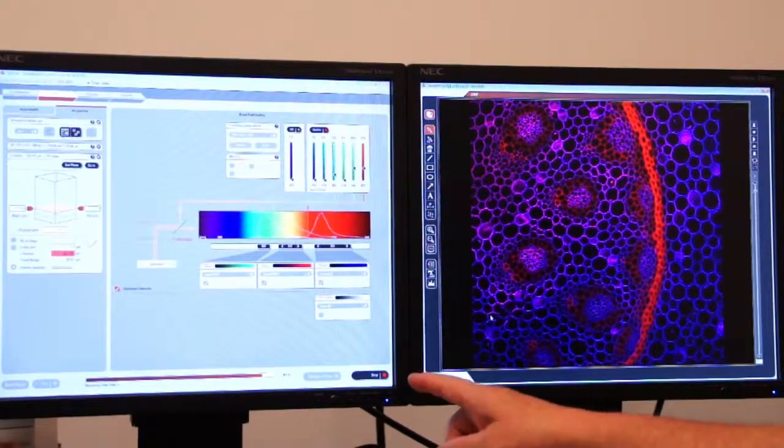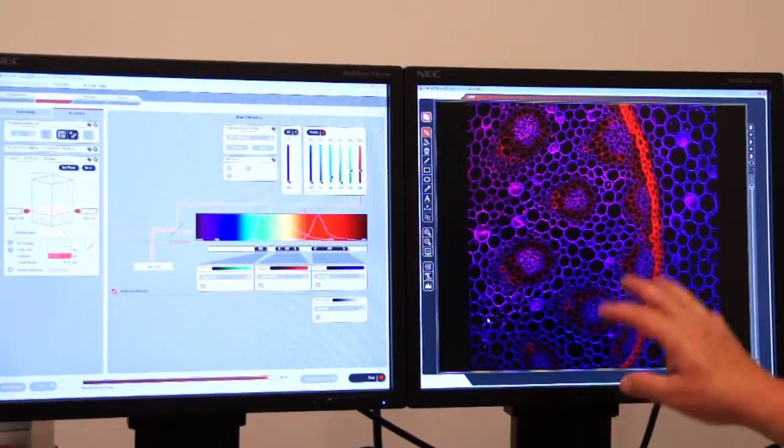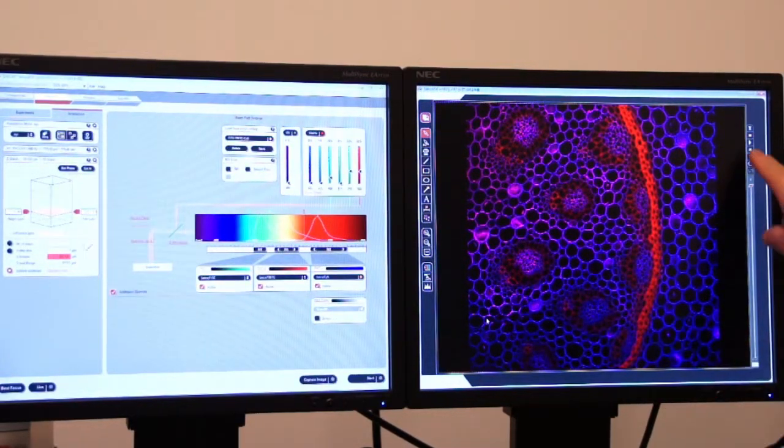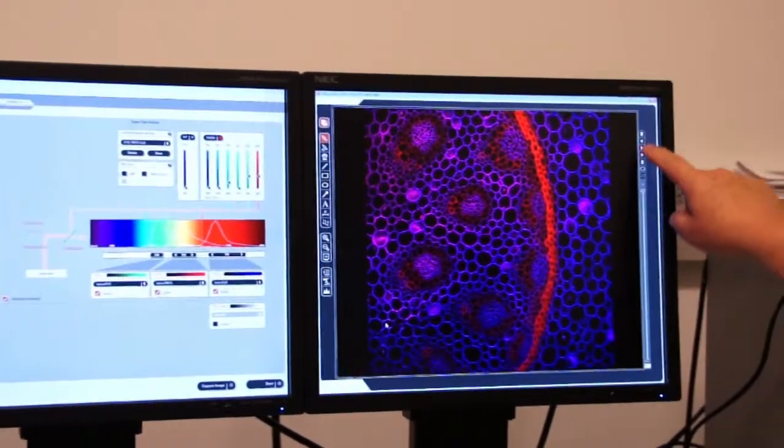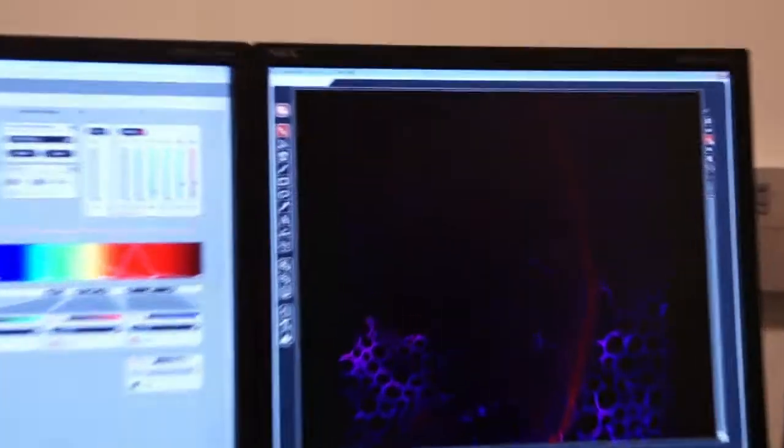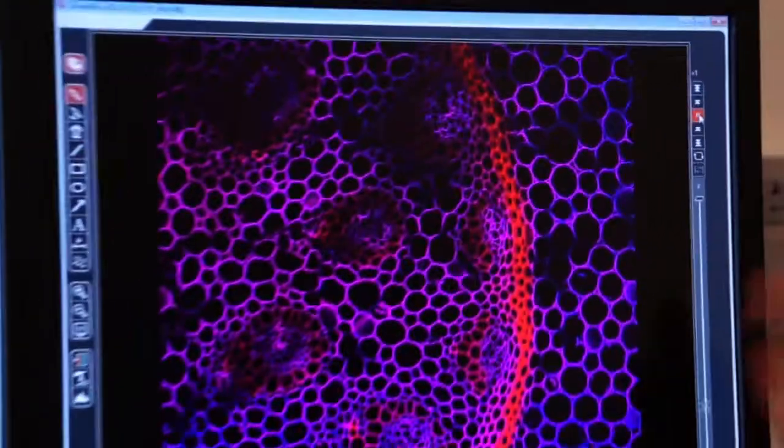So the system is almost done. It's at 93%. When it finishes, I'll have a movie over here on the right-hand side that I can then play. The system returns a whole set of icons here, which are for playing the movie that we've made. I can press play, and we can watch the image go through the Z-Stack in real time.